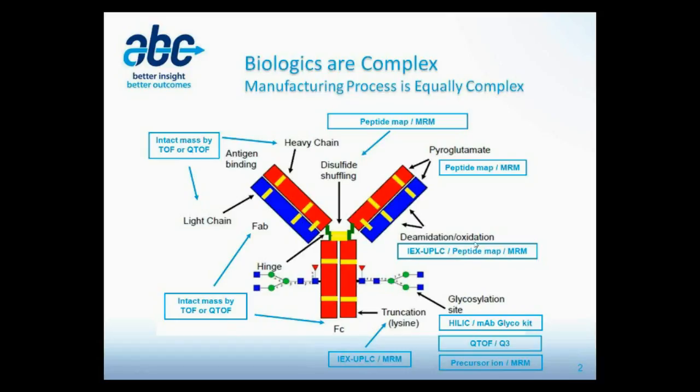Oxidation is another example, which typically happens in methionine residues in monoclonal antibodies. Typically, you have a +16, so you can design a transition pair to target the native as well as the oxidized form. And you know, a variety of things you can do, whether it's truncation or even on peptide mapping to complement the UV. You can also target specific peptides in the map of interest.